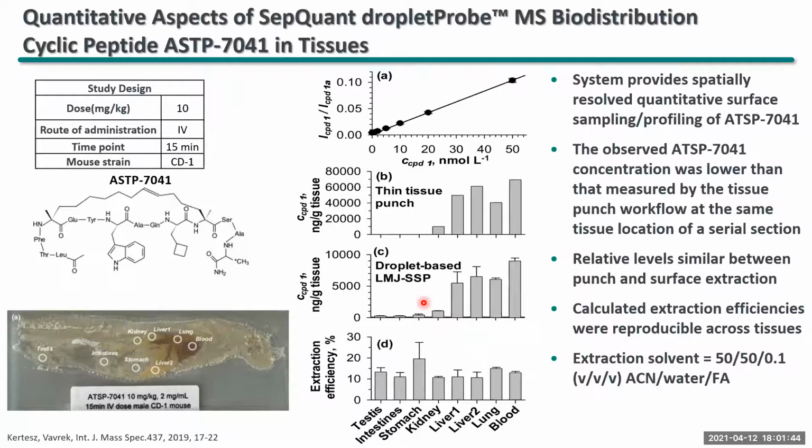And you're right. When we need true quantitation in tissue, we do the old school method. Yeah, I mean, we did this kind of work in the past. We called it a microsampling technique, where we were just going in and punching out with a sharpened syringe needle, and we did these extractions. And yeah, it actually compares pretty well to what you get if you're homogenizing bulk tissue and comparing results. So it is pretty good.